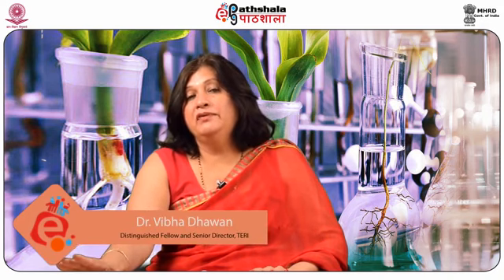So in this module, you have learned how a large number of shoots can be produced by tissue culture technology in culture, and what precautions are to be taken while we multiply shoots so as to ensure that they remain clonally uniform, and we meet the objective of producing mirror images of the mother plant, or true-to-type plants. The shoots must be prepared so that they can be rooted very well, and then taken to the next stage of rooting and transplantation. So I hope you have enjoyed this particular talk and would like to take tissue culture as a career.